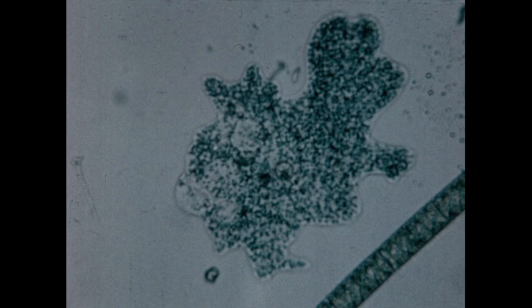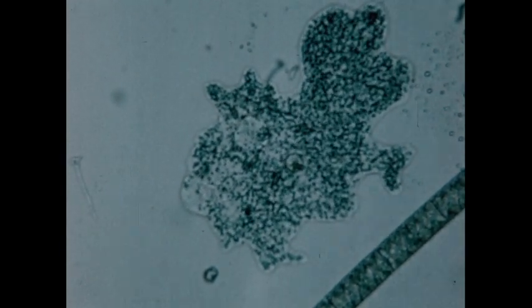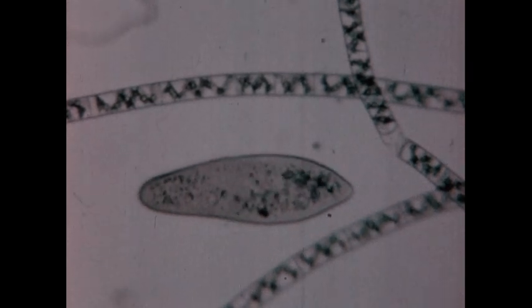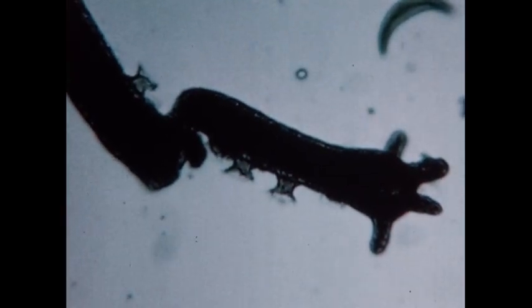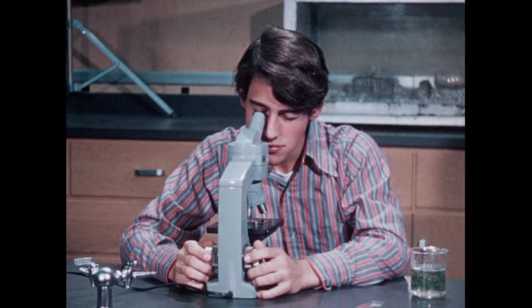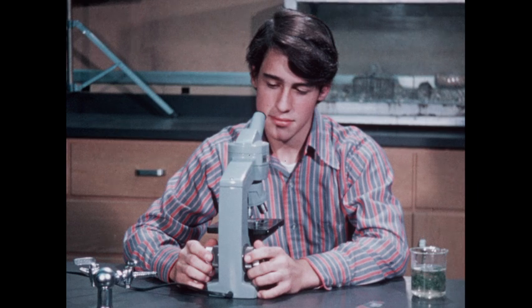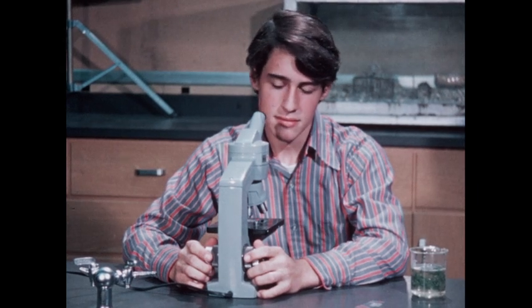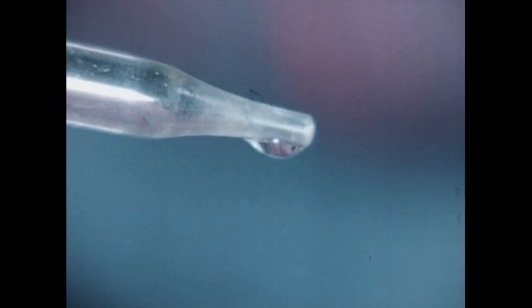These living forms are much more complex than the simple amoeba, but all of them must meet the basic requirements of life: moving, reacting, obtaining food, and reproducing. These are the same requirements needed by higher forms of life. Even our own requirements for living are no different than those we see in the teeming life in a drop of water.